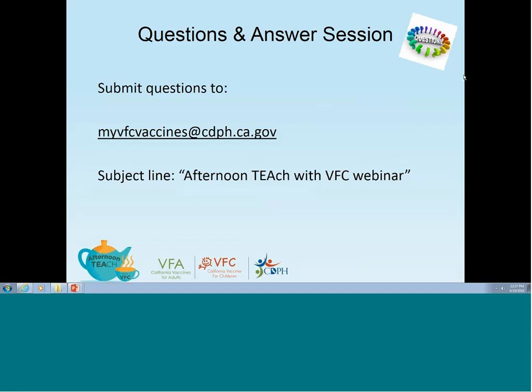Is this the same WebEx as the introduction to digital data loggers offered in February 2018? No, this is not the same. This one is different in the sense that we talk a little bit more or stress the importance of making sure you configure your data logger correctly, understanding how to handle alarms, and the importance of understanding that you have to download and save your data files.